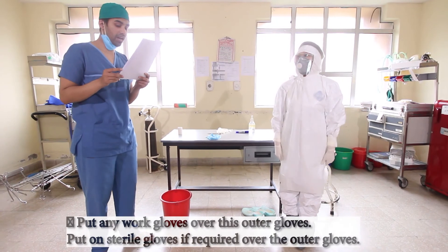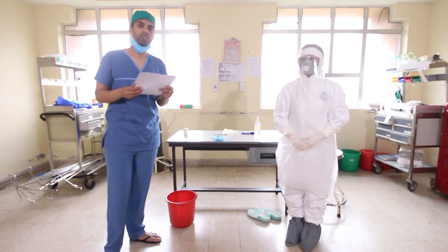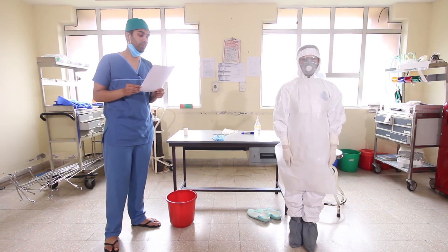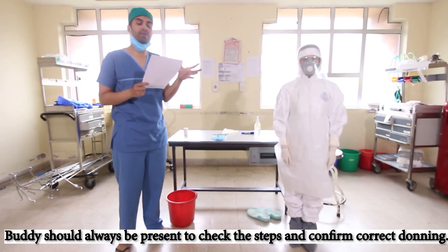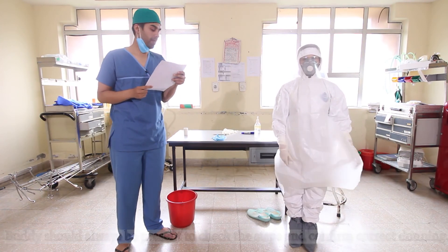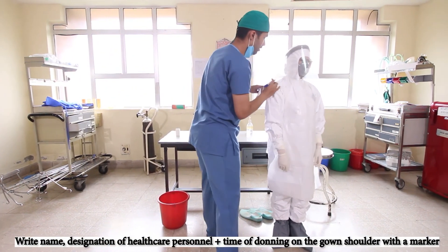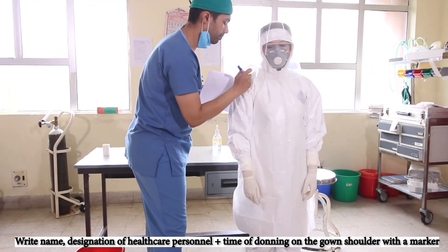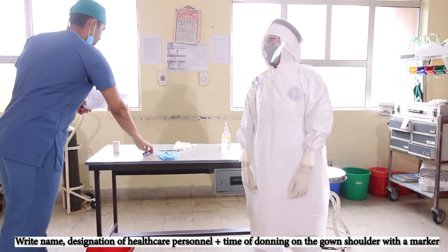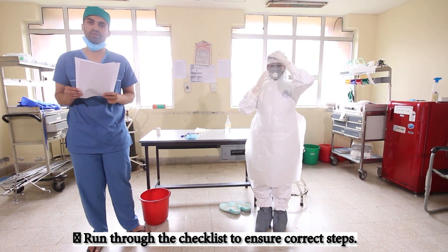After this, if sterile gloves are to be put on, we can don them now, or any other work gloves required. This completes our process of donning the personal protective equipment. The buddy should always be present throughout the process to check and confirm correct donning. Finally, mark the name of the healthcare personnel, and run through the checklist to ensure all steps have been completed correctly.